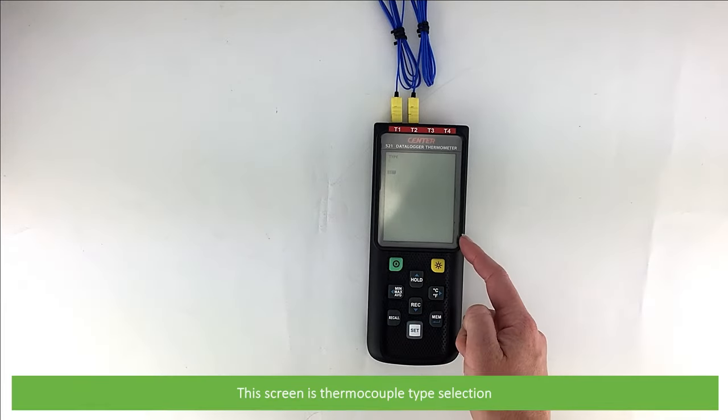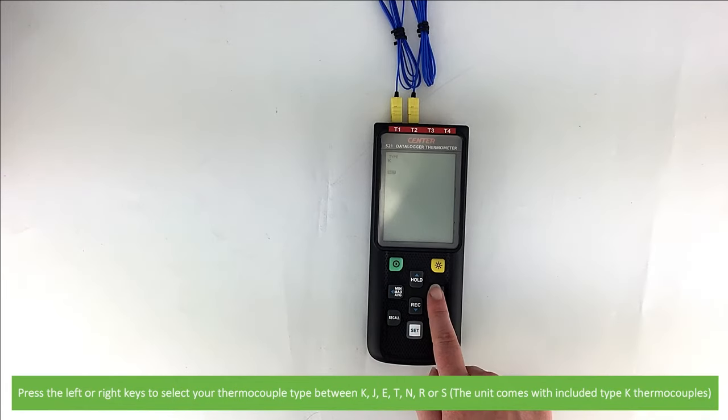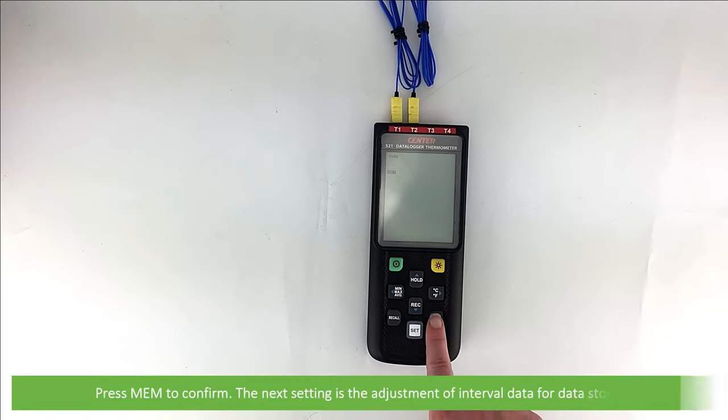This screen is the thermocouple type selection. Press the left or right keys to select your thermocouple type between K, J, E, T, and R or S. The unit comes with an included type K thermocouple. Press mem to confirm.